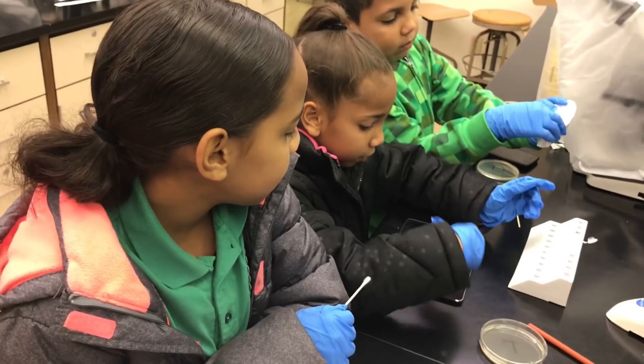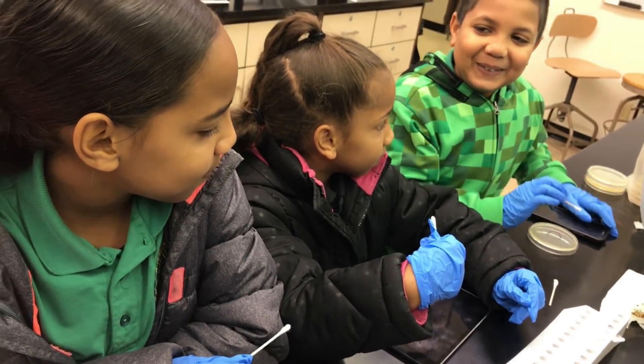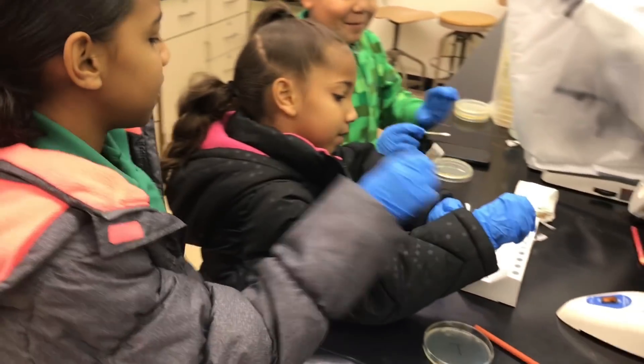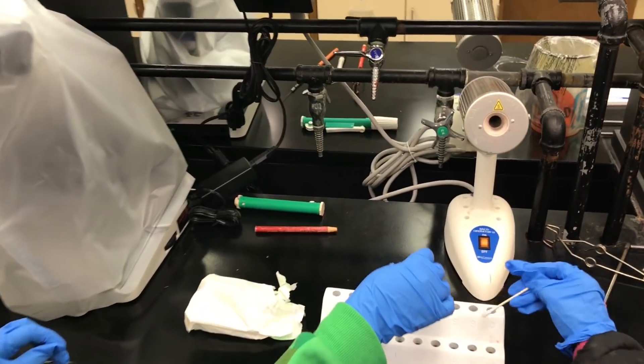I'm doing the laptop. I'm gonna be doing the iPad. I'm gonna be doing the cell phone. First we're gonna dip the swab in the tube containing PBS.